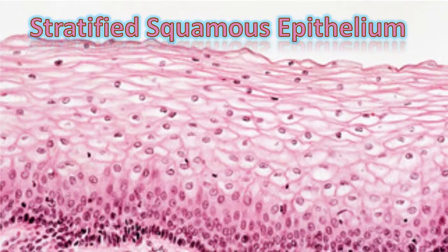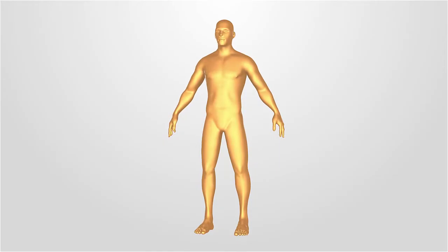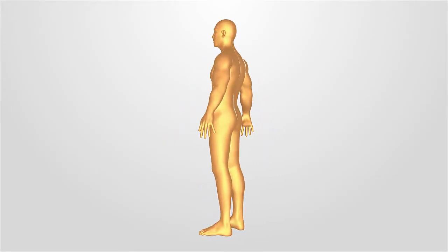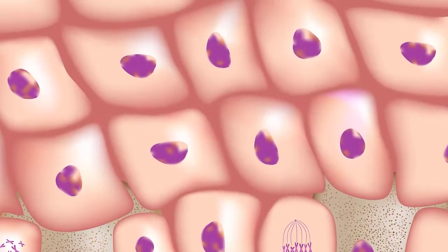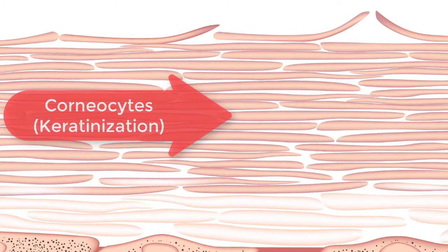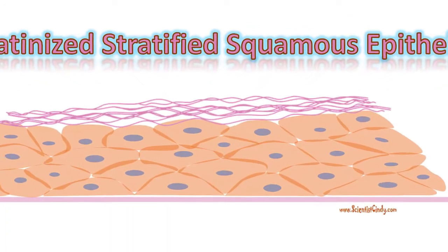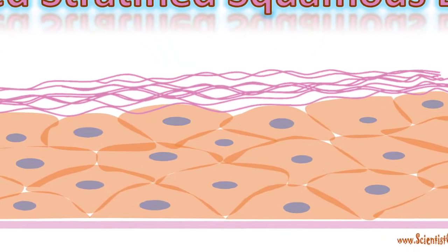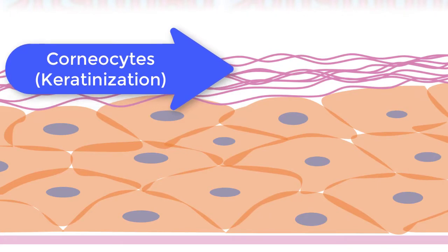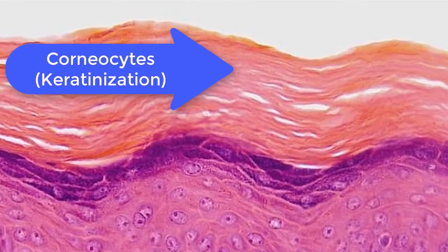This slide shows the non-keratinized stratified squamous epithelium of the tongue. The stratified squamous epithelium that lines the outer surfaces of the body is characterized by dead skin cells that cover the surface and provide added protection. This keratinized stratified squamous epithelium is composed of numerous layers of dead squamous skin cells called corneocytes, and is found on the outer portions of the body.